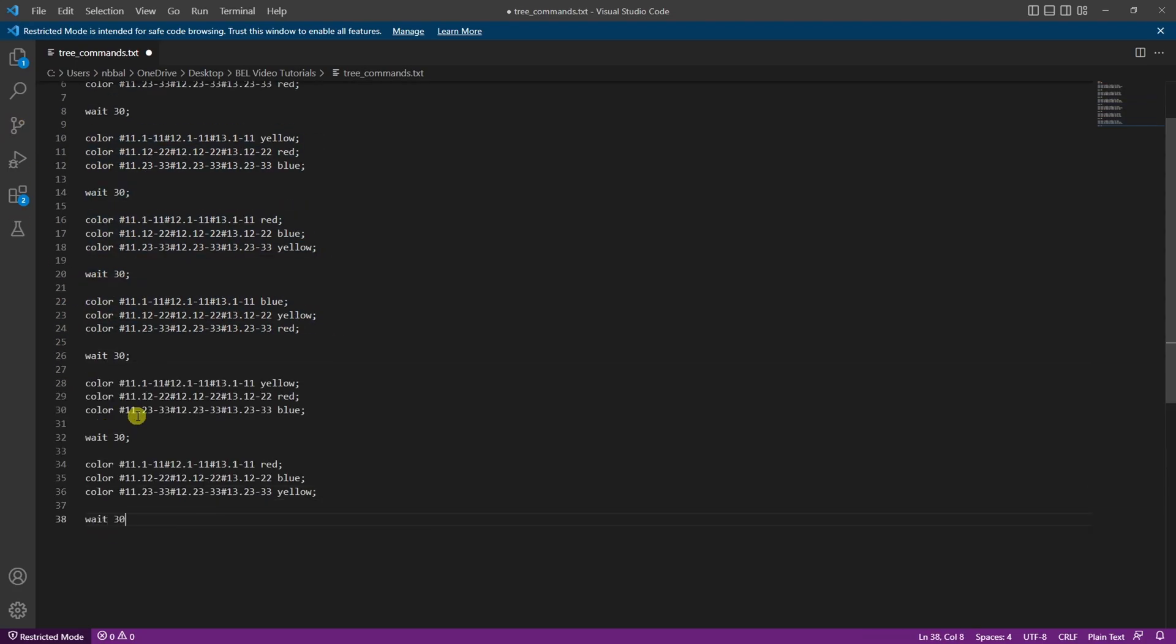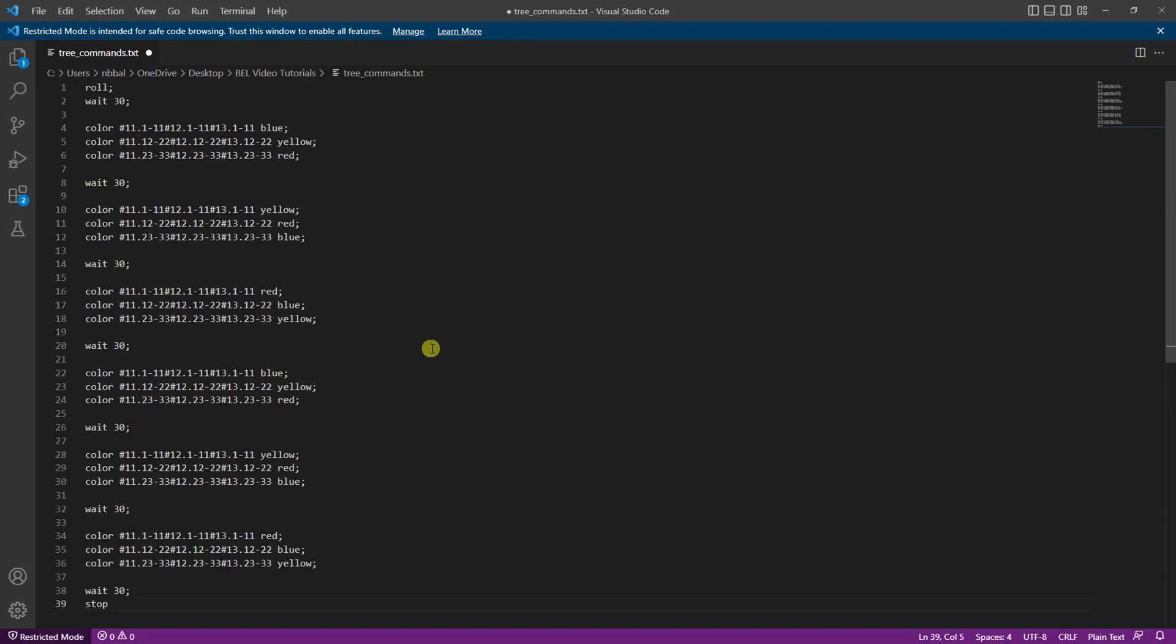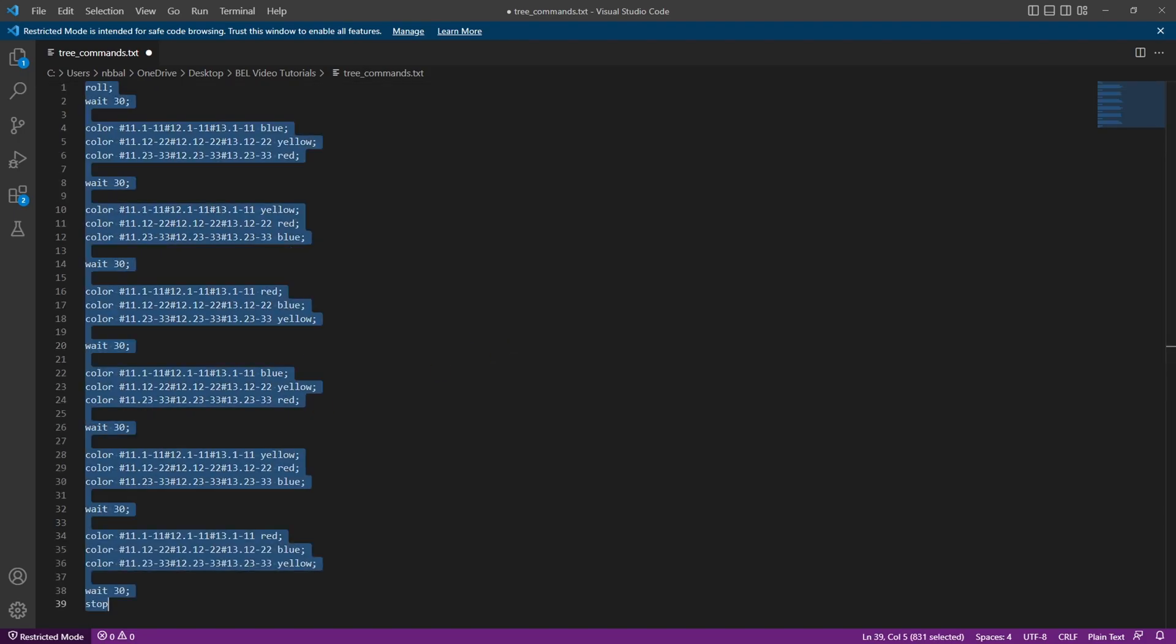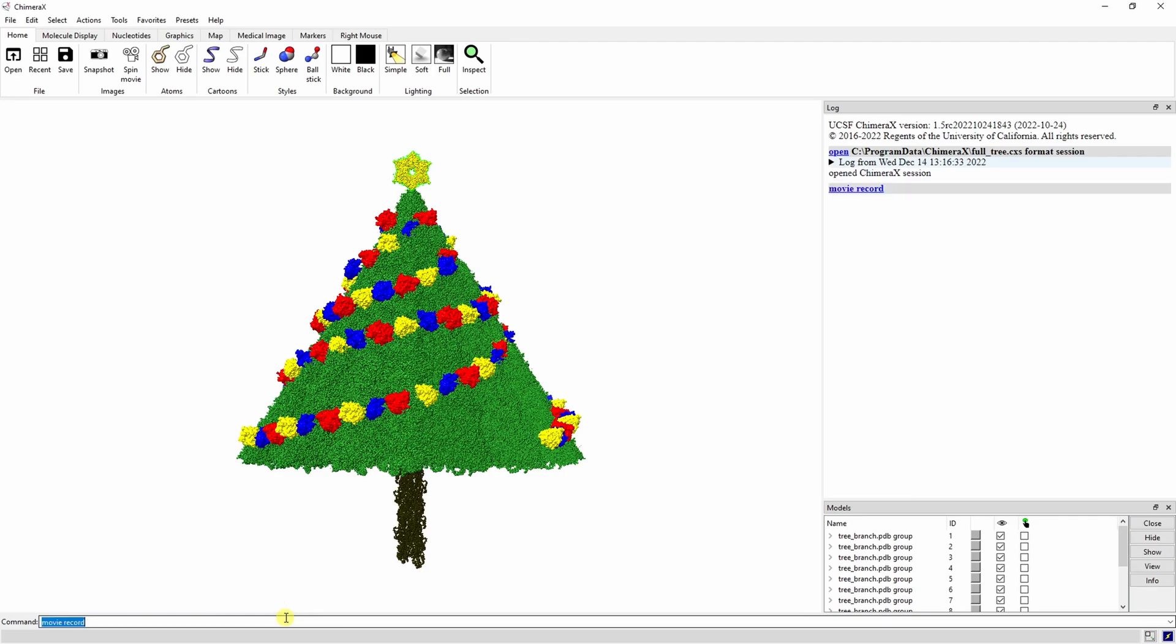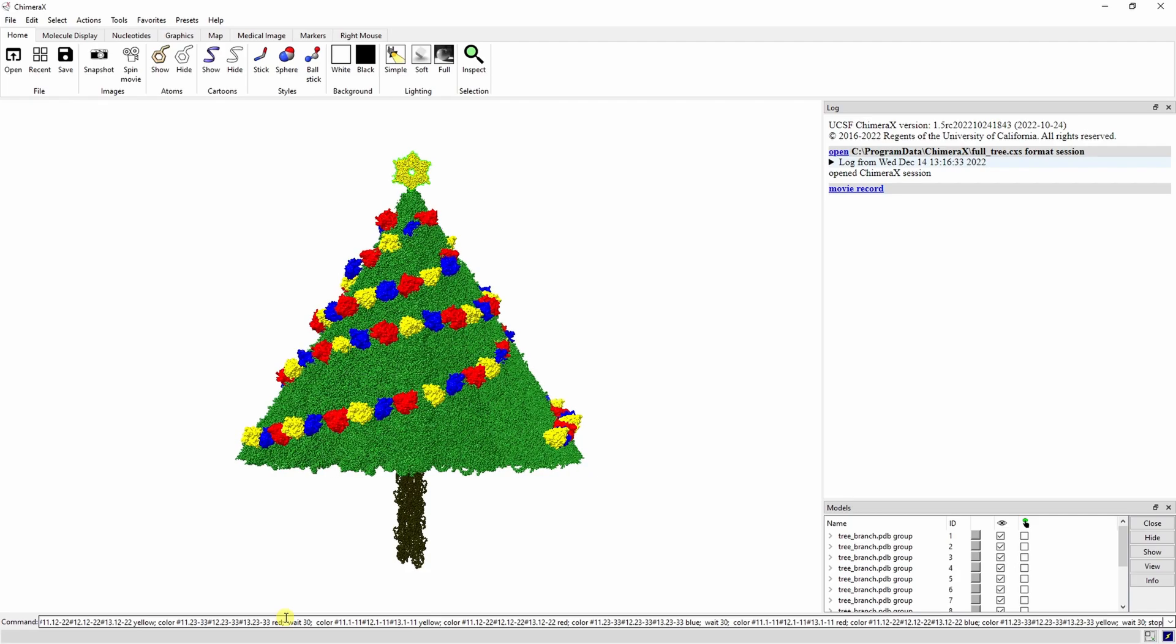Let's copy all of this then go back to Chimera X. As always, start with the movie record command, then run your single line command. This is probably going to freeze up your computer, but don't worry, everything is still being recorded.